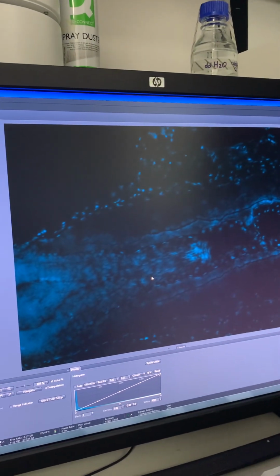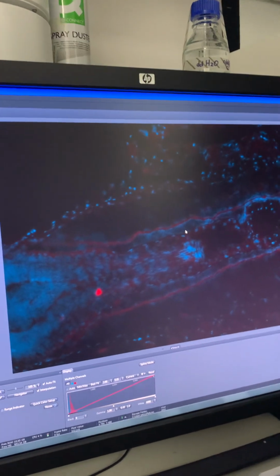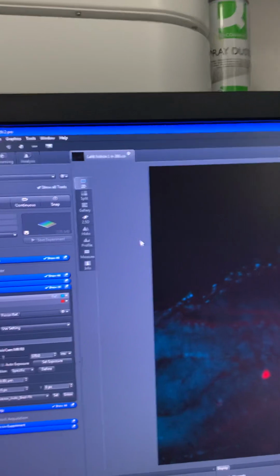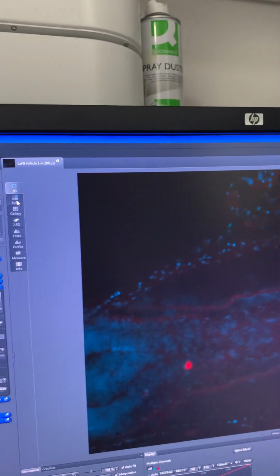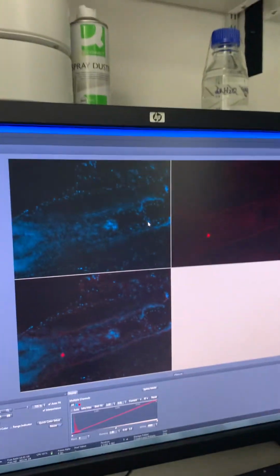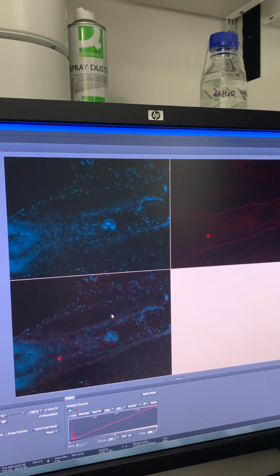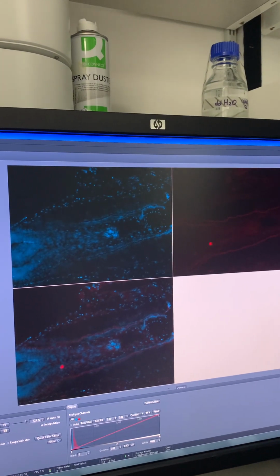So it'll take the two pictures and it'll layer them on top of each other. Cool, simple. So after that, what you've got is different ways to view it. The standard way it comes out is 2D, but you can hit split and it'll split it into the two or three or however many different colors and show you the overlay and bottom. If you do something bigger, you have a Z stack or various other things, so these buttons in here.